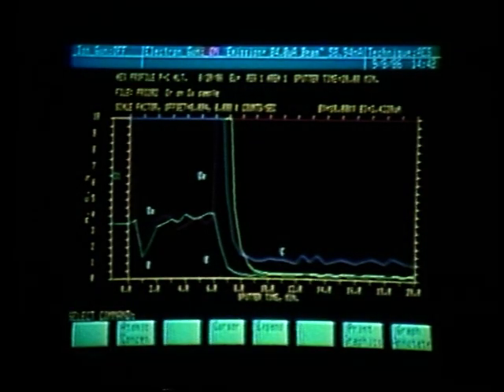Let's once again look at cycle number 10, which is sputter time, or in the profile, 4 minutes. And we can also compare that with cycle number 1, which is 0 minutes. Once again, we want to not include the silicon peak.